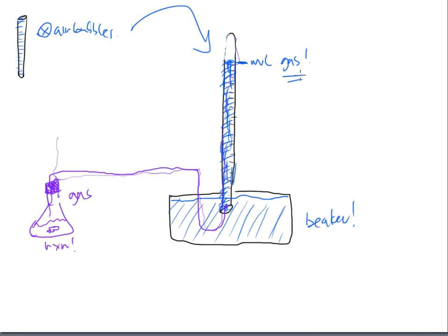All right, so I'm going to make this setup a little easier for you. I think that over the course of years, when we've done the lab, we've done away with a lot of the stuff. And by doing that, it's made it very easy to set up and go. Very, very fast reactions here. So the first thing that we need to talk about is we do away with the piece of glassware. All right. We don't really care about the glassware.